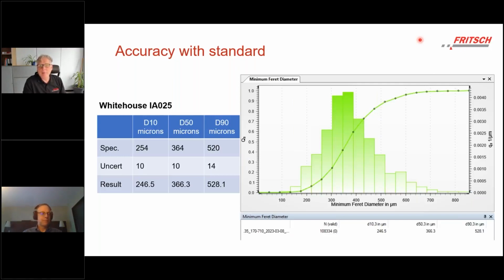So some people believe, when you look at the size range that you can cover with this instrument, or in general with this kind of instruments, not only this one here but similar as well, and the measurement range starts at, let's say, 10 microns, 5 microns, 20 microns, whatsoever, and then you have a sample in this size range, and then people still ask for super accurate information about shape.